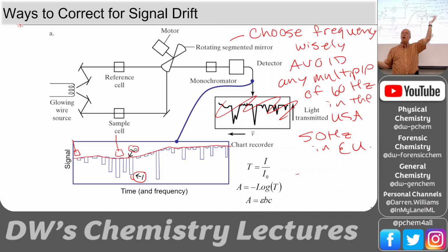And you're like, my spectrometer's broken. No, well, maybe the motor on your chopper's broken and it's running at 60 hertz. It needs to run at a frequency that has nothing to do with 60 hertz, not 120, not 180, not 360, none of those frequencies, because all of them will have some interference that will destroy your signal, because the interference will be greatly larger than your signal. So anyway, that's a little pro tip.